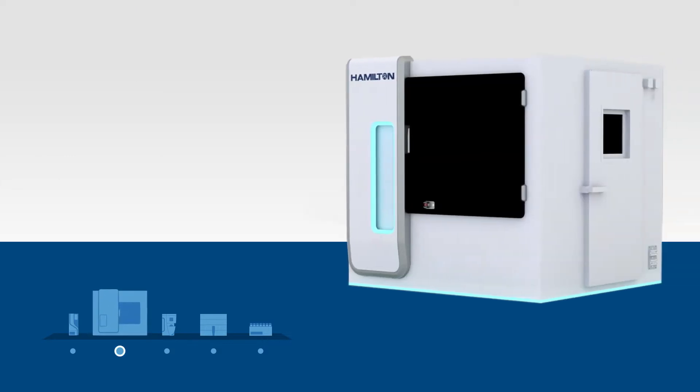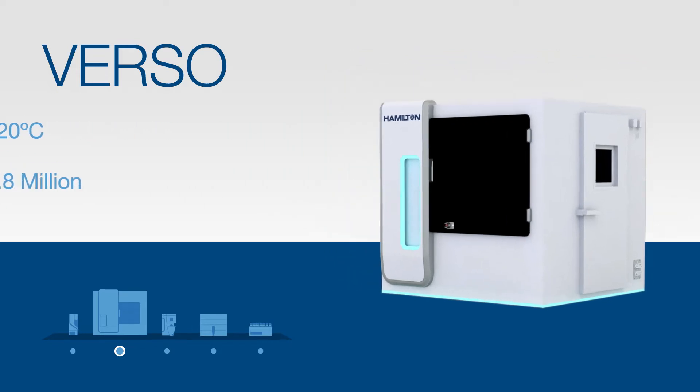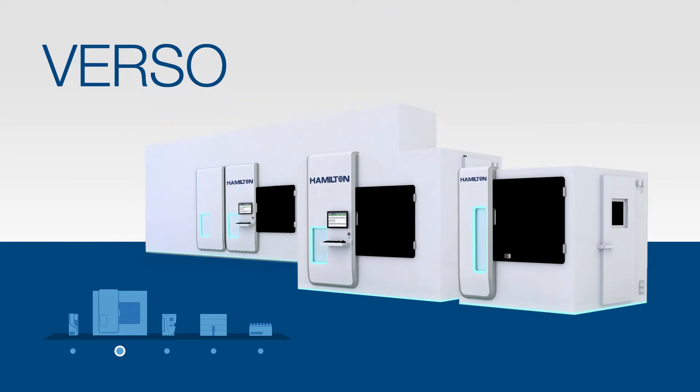We'll now move on to Verso, a scalable medium to large capacity high throughput machine for samples stored at ambient to negative 20 degrees Celsius. Sample storage capacities for Verso can range all the way into the millions thanks to the ability to add modules. The Verso shown here is an example of one module, but you can add more modules to increase capacity to fit your needs.